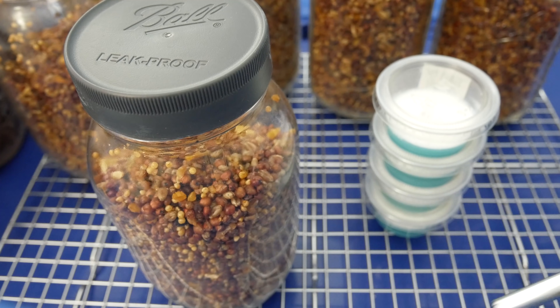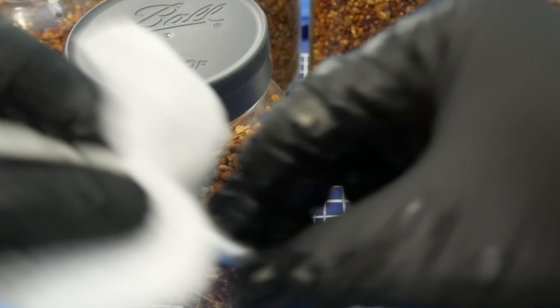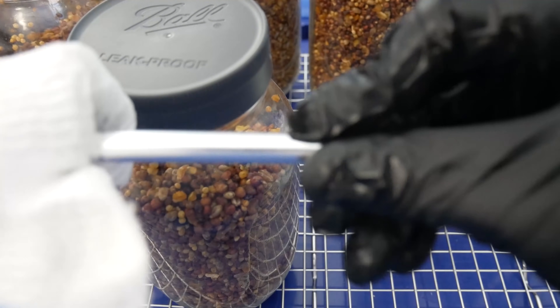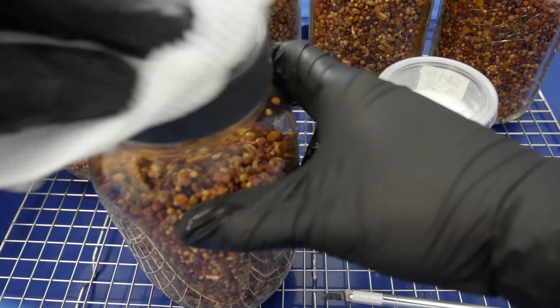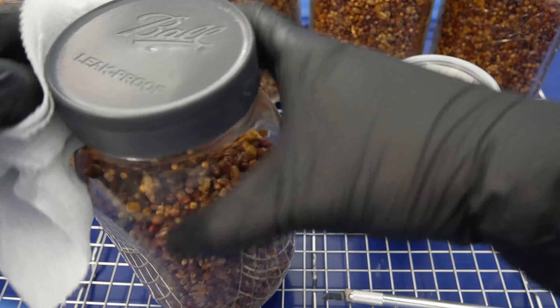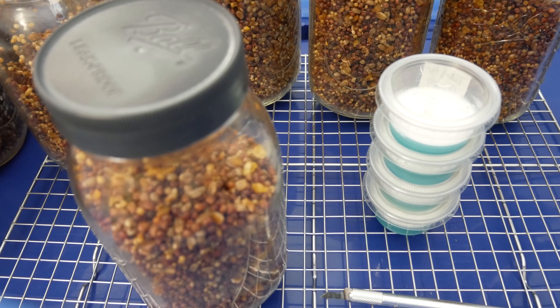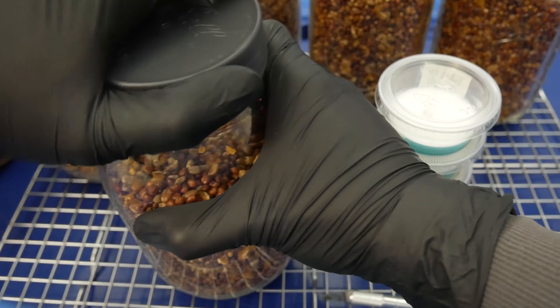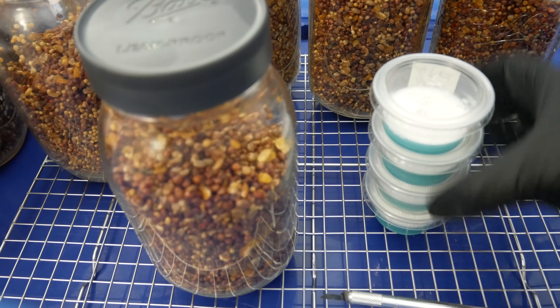First things first, we want to go ahead and sanitize our equipment. I just went ahead and wiped down my blade and my gloves with 70% isopropyl alcohol. Next up, I'll go ahead and wipe down the jar lids as a precautionary measure. Now, it's already been cleaned coming out the pressure cooker and already been sterilized, but you can never be too careful. The process of spawning agar to grain will work for any grain you decide to use — oats, brown rice, wild bird seeds, popcorn, whatever it is.